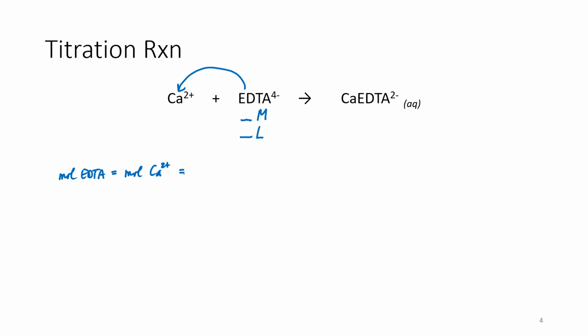and thinking about the units for water hardness, for every 1 mole of calcium, that's 1 mole of calcium carbonate. So remember, we're trying to get to milligrams of calcium carbonate for every liter of sample. So we can convert moles of calcium carbonate into grams of calcium carbonate, and then milligrams of calcium carbonate. And then remember to divide by the volume in liters of sample that you titrated.